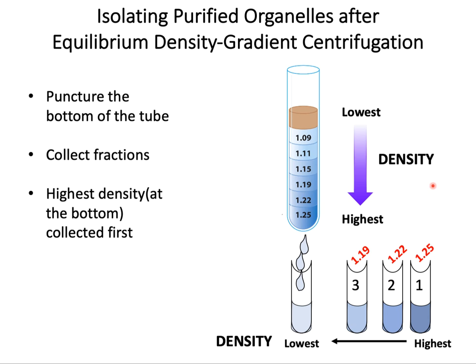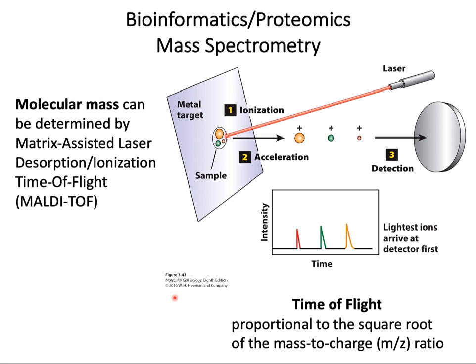on your purified organelle. So let's say we are interested in determining all the proteins found in the mitochondria that you have purified as shown in the previous slides. We want to define what is known as the mitochondrial proteome, every protein in those mitochondria. You can do this by mass spectrometry. This is a diagram that shows the principle of mass spec.